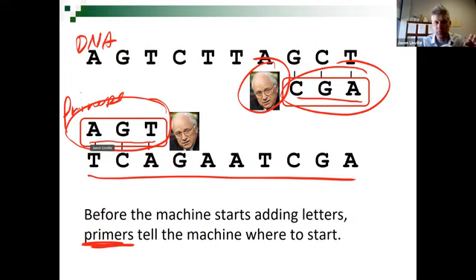And based on the sequence of the primers that we can control when we're squirting them into the tube, we order primers of a certain sequence, squirt them into our amplification tube. They're only going to attach in specific areas of the DNA. So we get one to attach at the beginning of where we want amplification to start, and the other to attach at the end of where we want amplification to stop. Okay. And we sort of start at one end, start at the other end, and make a copy of either side of the DNA. Okay. So those primers are the second thing that we need in a PCR reaction.